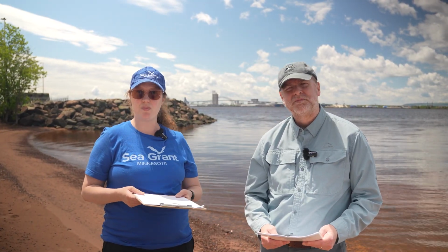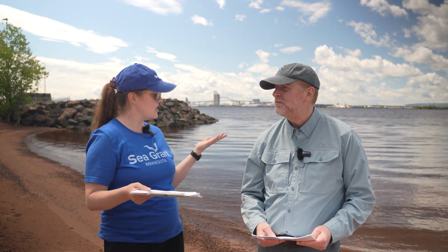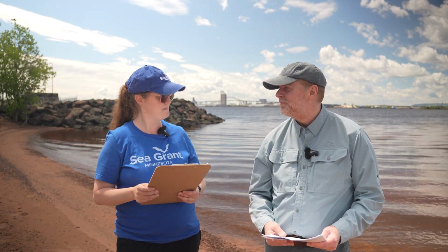And today we are going to be filming our second video tutorial for this project. Way back in the beginning of 2026, you saw us out on a lake that was frozen at the time. We drilled a hole in the ice and talked about collecting water samples for looking at chloride concentrations. Today you can see we're in a little bit of a different environment, and today we are going to be focused on collecting a water sample if you see an algal bloom on your lake.